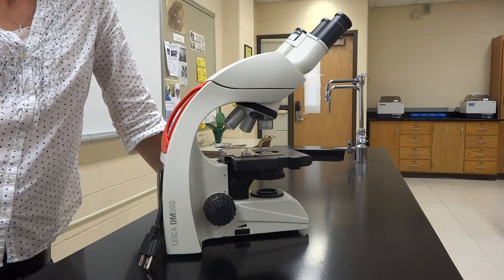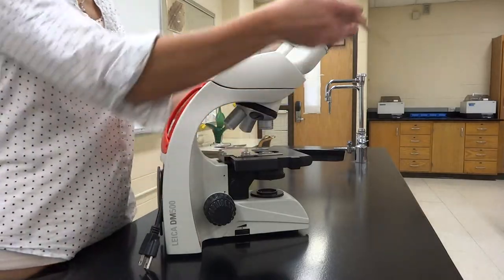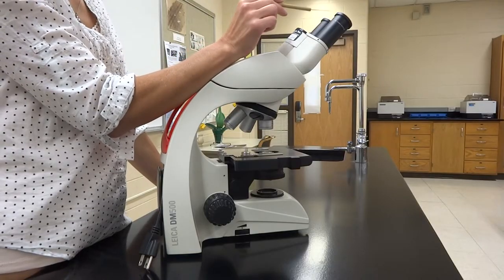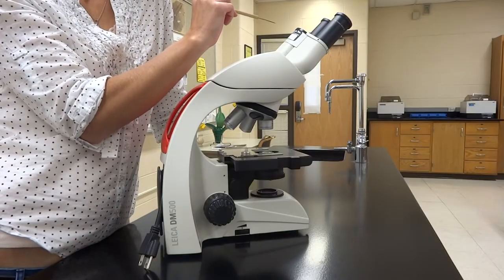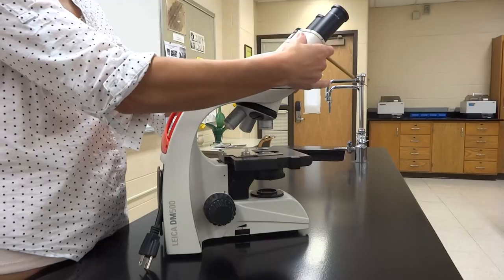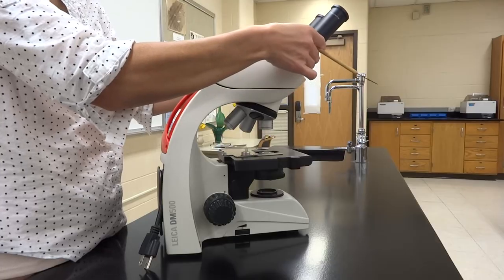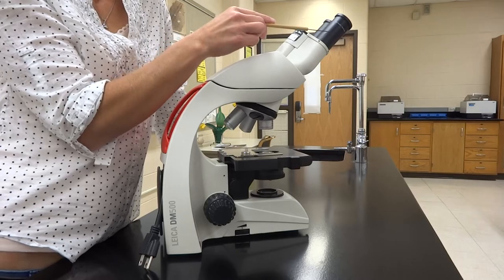We're going to start at the very top with the things you look through, which are called the oculars. Our oculars have a 10x magnification, so they magnify things 10 times. They are also adjustable so you can move them to match your eyes — if your eyes are close together, push them in so you can actually look down onto your specimen.